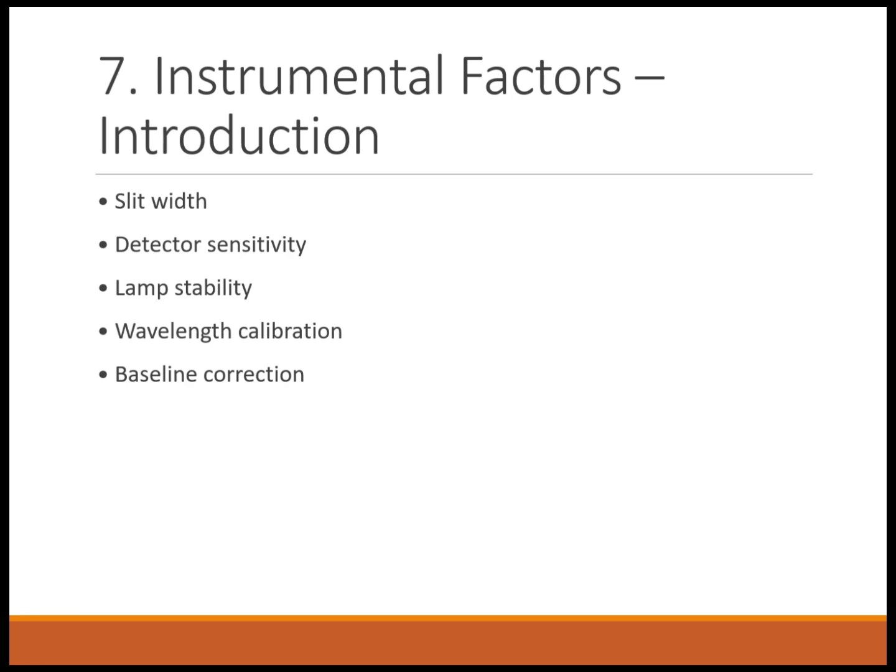They must be optimized for precise spectra. These are the important factors which should be optimized during an accurate measurement, and we will discuss these factors in detail.